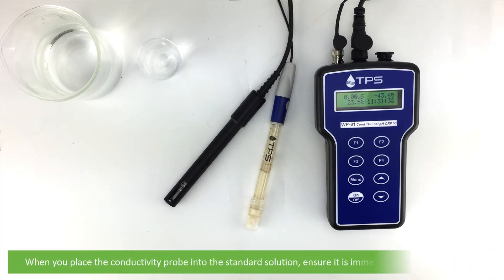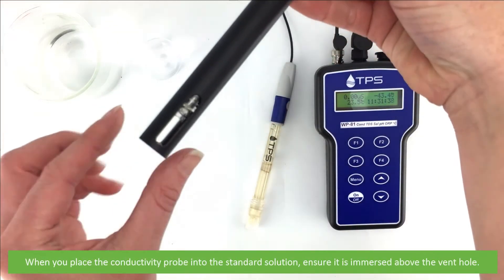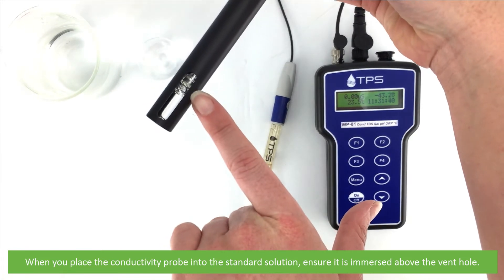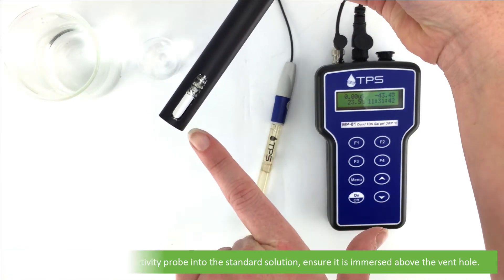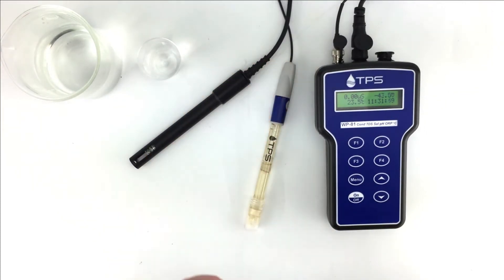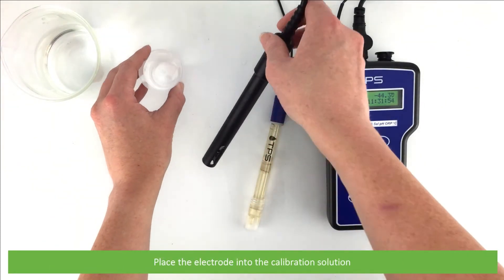When you place a conductivity probe into standard solution, ensure it is immersed above the vent hole. Place the electrode into the calibration solution.